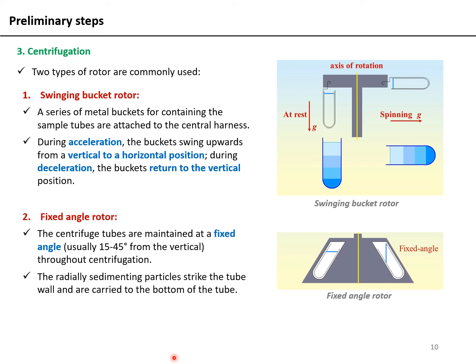So what exactly do I mean by the radially sedimenting particles? When we were talking about the forces acting on the particles suspended in the solution during centrifugation, we had the centrifugal force acting downwards, and we had the buoyant force and the frictional force acting upwards. If you think about the diagram that we looked at a couple of slides back, you can go back to just revisit it.